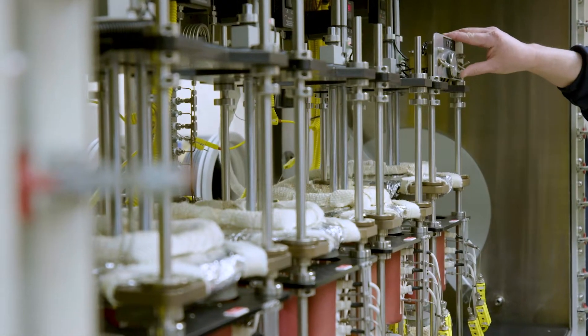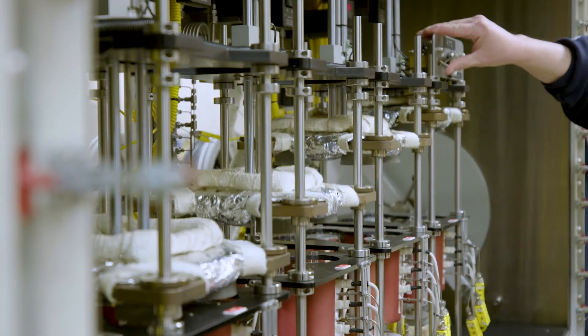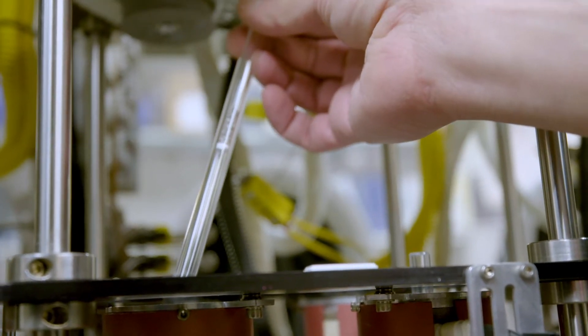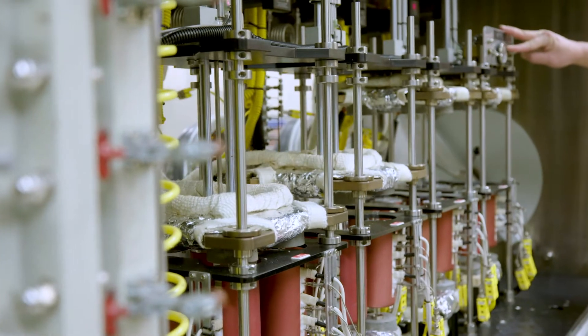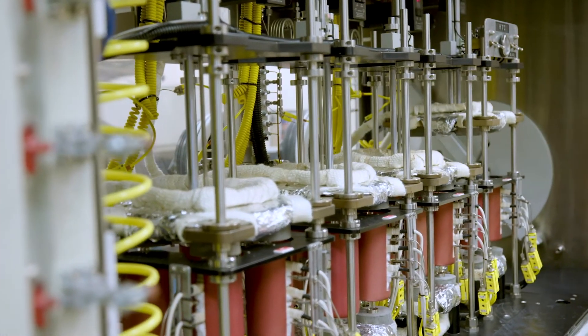The next step is high-throughput chemisorption (HTC), a measuring process that looks at the quality and availability of metals in the catalyst. These measurements give engineers an estimate of the product's catalytic performance.